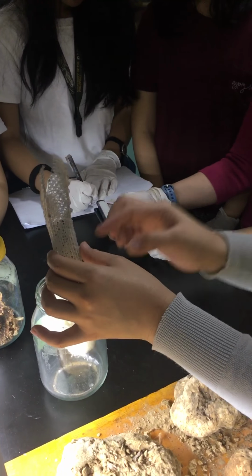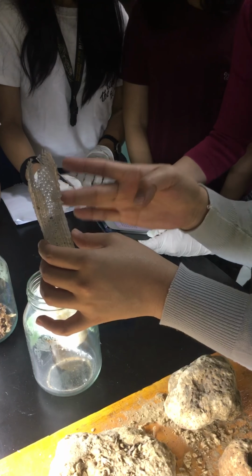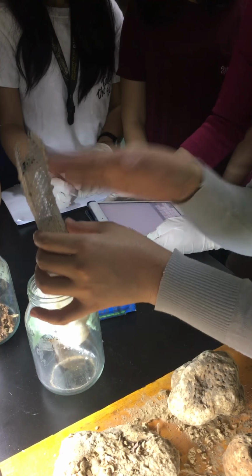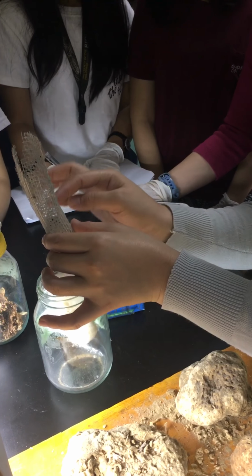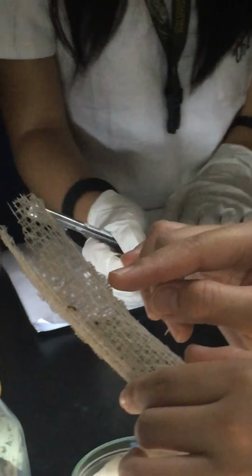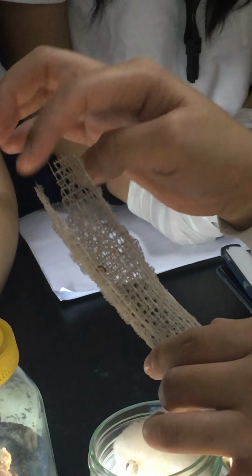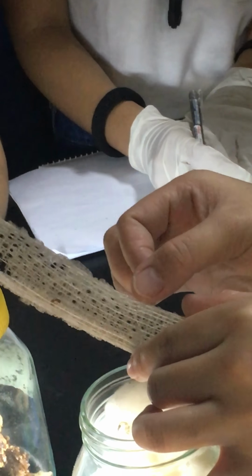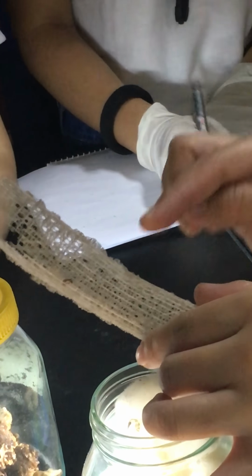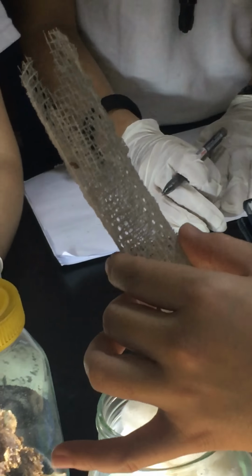So take note, usually these are found in seawater, in deep areas. Usually they are not brushed, and they are very white, their lattices. So they have networks. Very white. If you can see, there are small things there. Those are not dust. Those are spicules, their skeleton. Notice, they have something like microscleres. There are large parts and fine parts joining them. These are actually made up of spicules in the form of microscleres or megascleres.